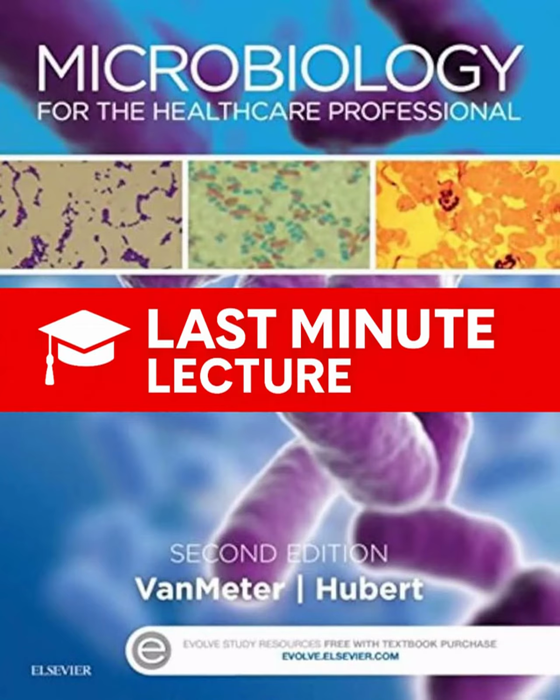Because 42 degrees is cool enough that you can pour it, even mix bacteria into it, without heat shocking or killing most of them. If it solidified at, say, 60 or 70 C, you'd cook your sample trying to mix it in. That big temperature gap between melting and solidifying gives you a working window. You can melt it, cool it down to a safe temperature, add your bacteria, pour your plates or tubes, and let it set. It's incredibly practical.